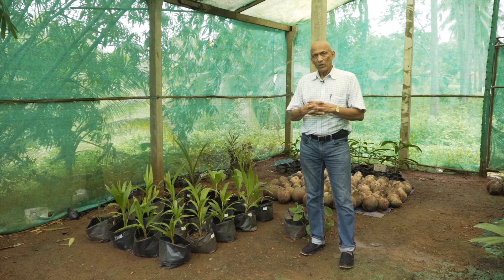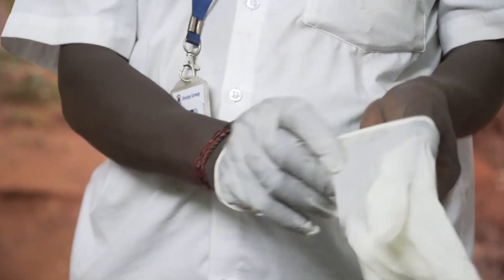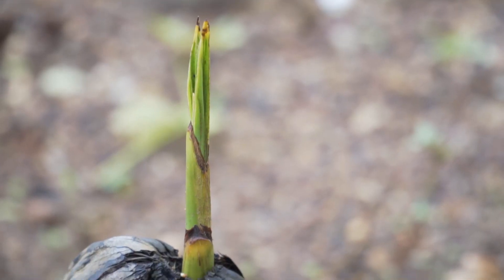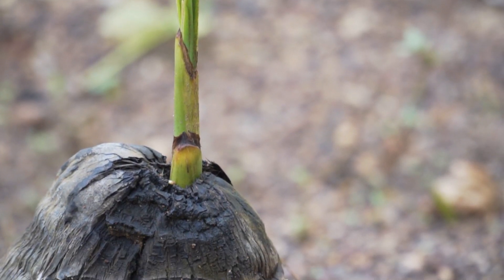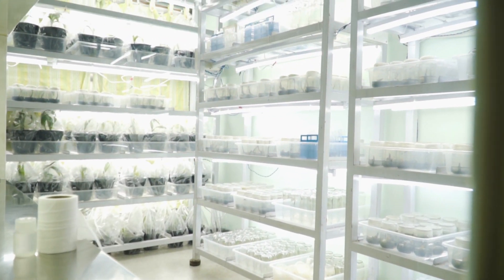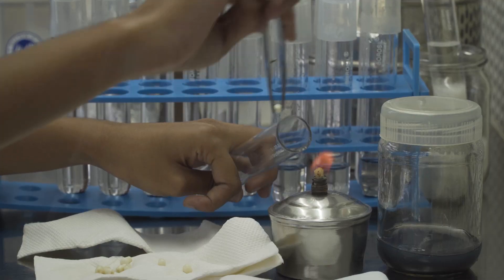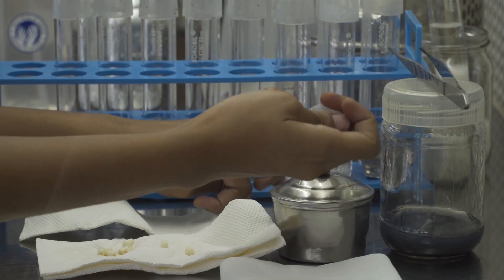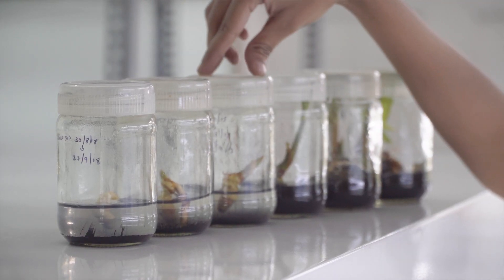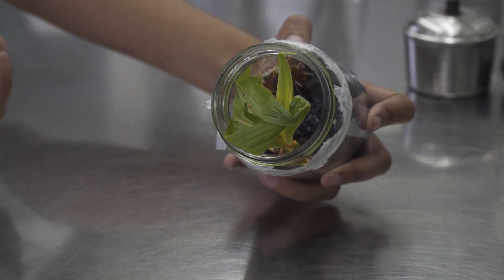Growing a coconut palm from an embryo is called embryo culture. Sometimes we have to resort to this when a palm will not grow from a seed. We have some embryo cultured coconut plantlets here. The process is removing the embryo in the lab, growing it in a test tube in sterile conditions, growing it into different stages, changing the protocol till it becomes a little plant in the laboratory.